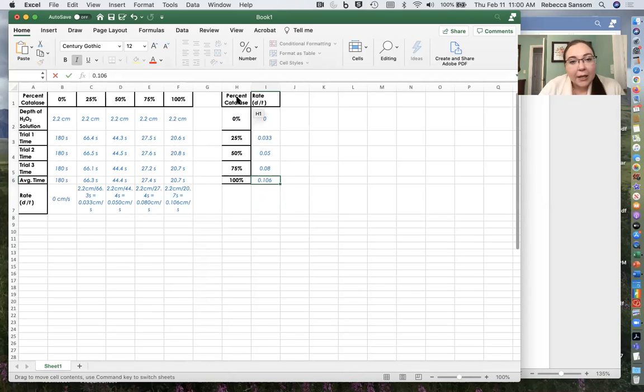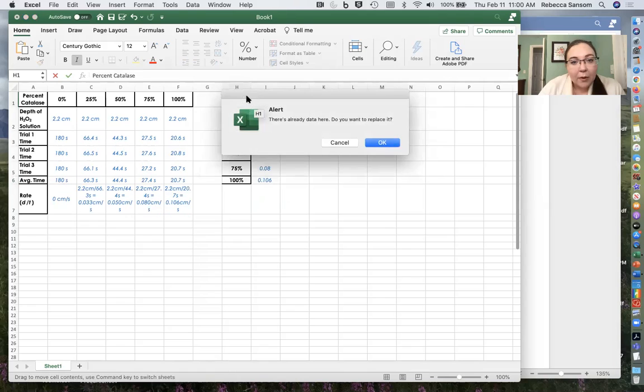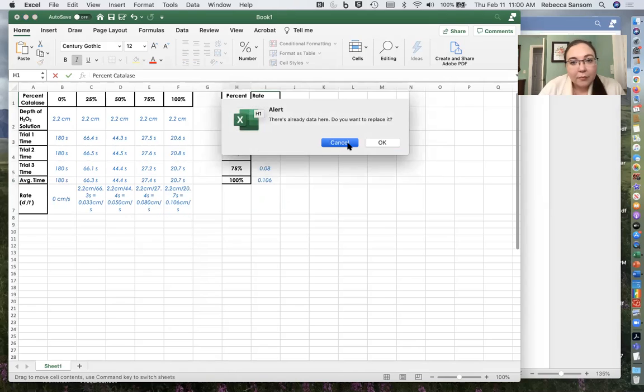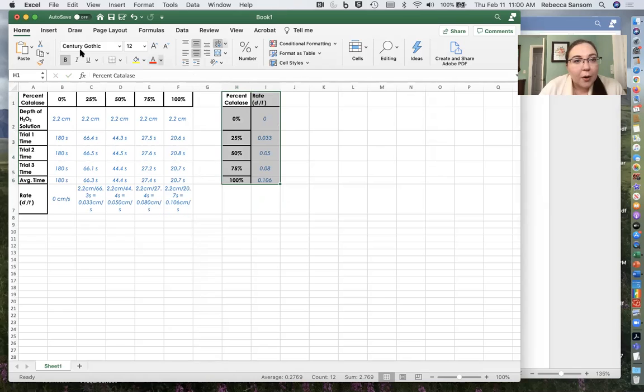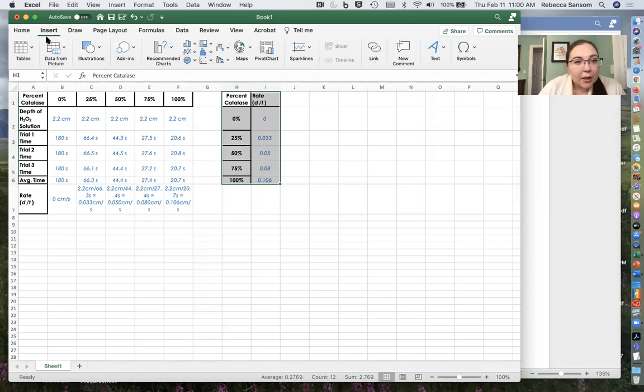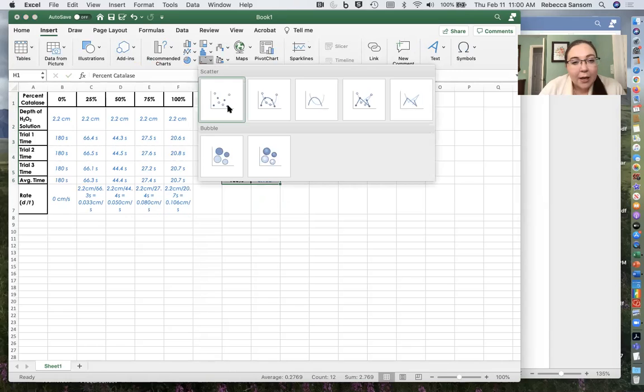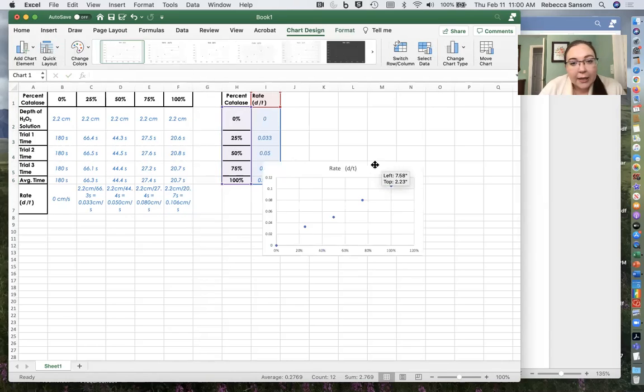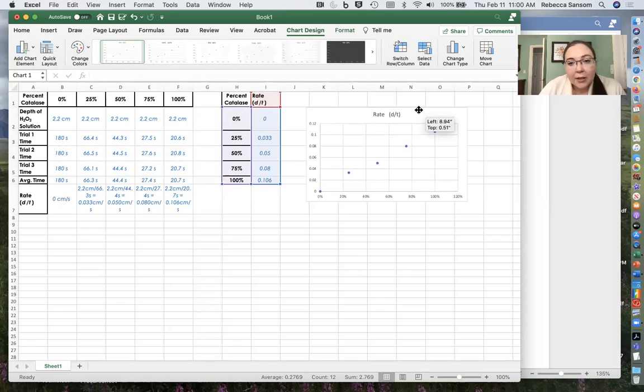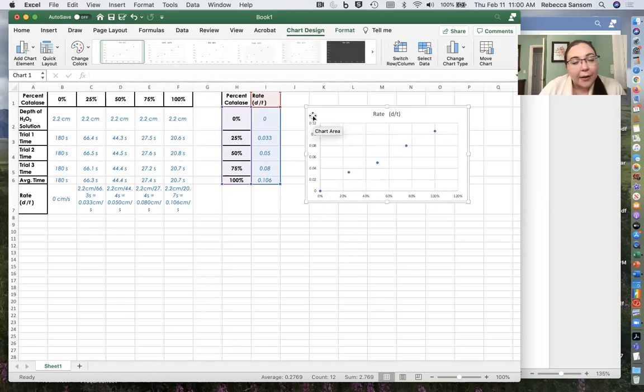Now I've got percent catalysts and rate and what I want to do is make a graph. So I'm going to go to insert and I'm going to go over here to this xy scatter plot and I'm going to insert the xy scatter. And it should look like this where we've got percent catalysts on the x-axis and our rate on the y-axis.